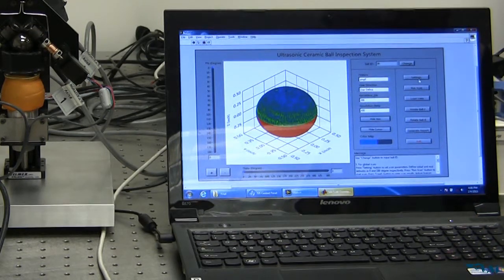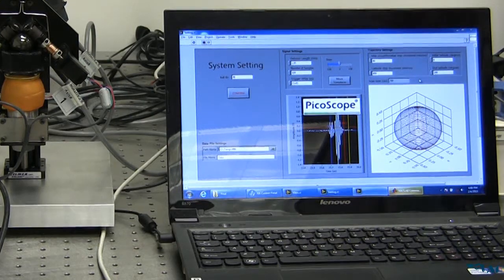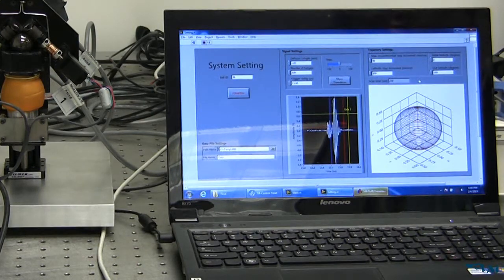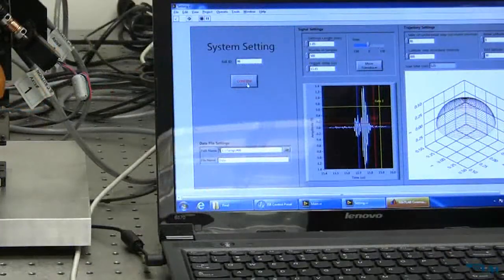Click the setting button to set up the data saving options, signal, and scan trajectories. Then press the run scan button to start scan.